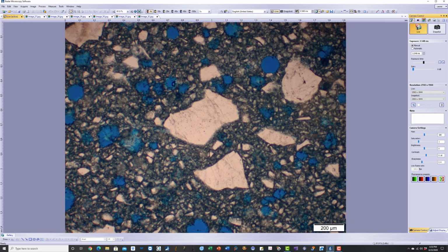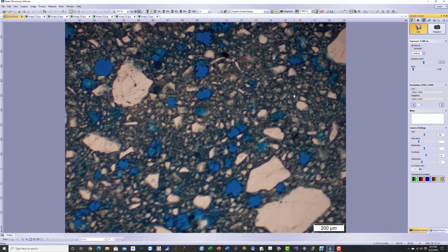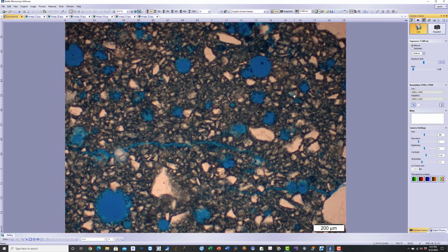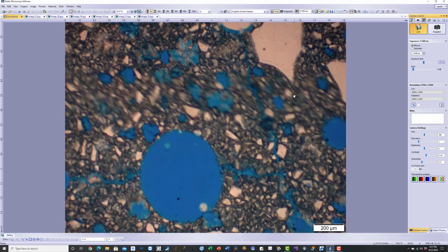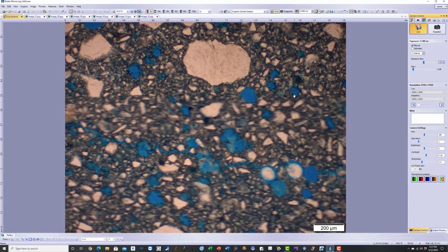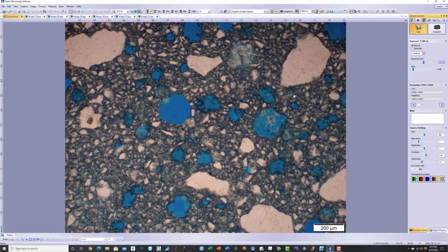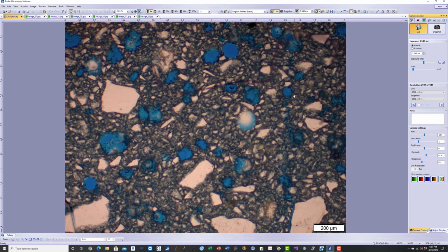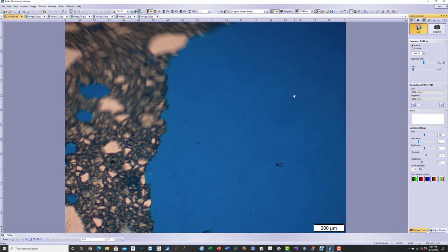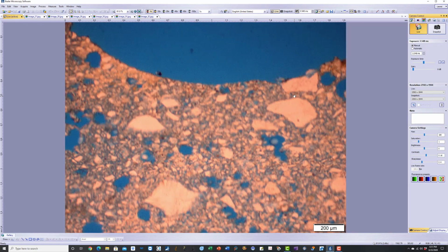the mortar made using a coarser fraction of sand and a dominantly finer fraction of crushed silica sand in a silica flour and polymer based matrix. There are some microcracks seen with blue epoxy, shrinkage microcracks in the mortar. Air voids are all seen with the blue epoxy. So there are multiple sections of this mortar present in the thin section.